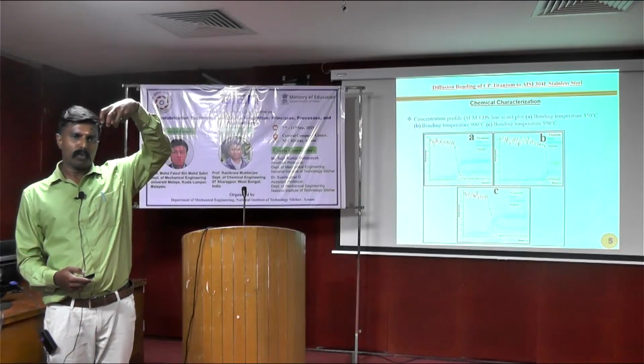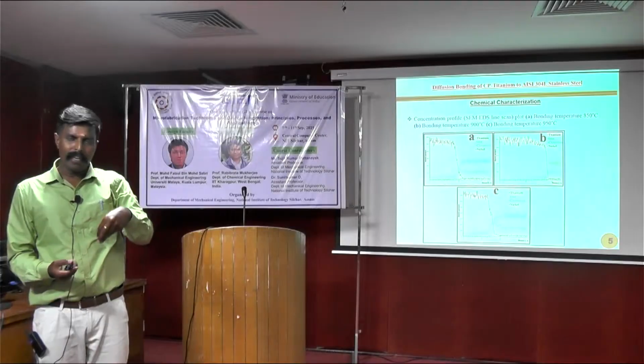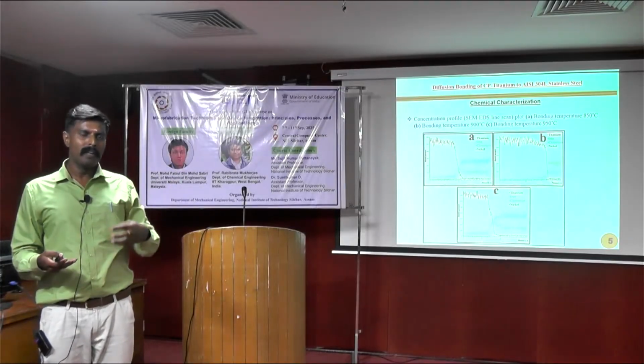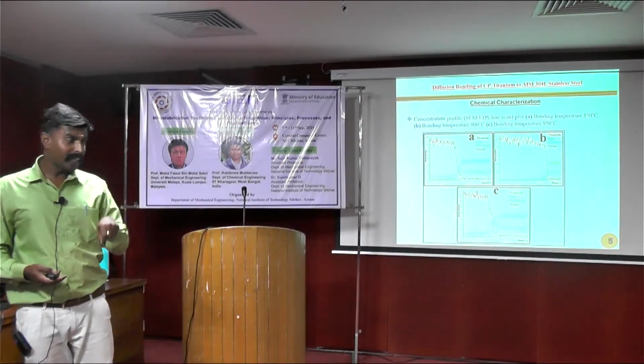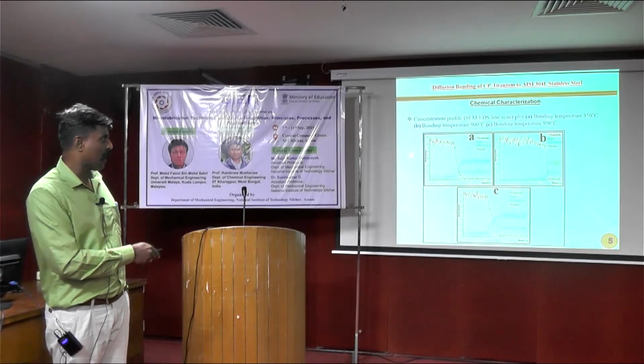The electrons are coming from the electron gun through thermionic emission. Those electrons will interact with the specimen. Then various signals will be produced. That is called secondary electron, then backscattered electron, then characteristic X-ray. So through that X-ray, this kind of detection happens. This is the energy dispersive spectroscopy, the line scan.